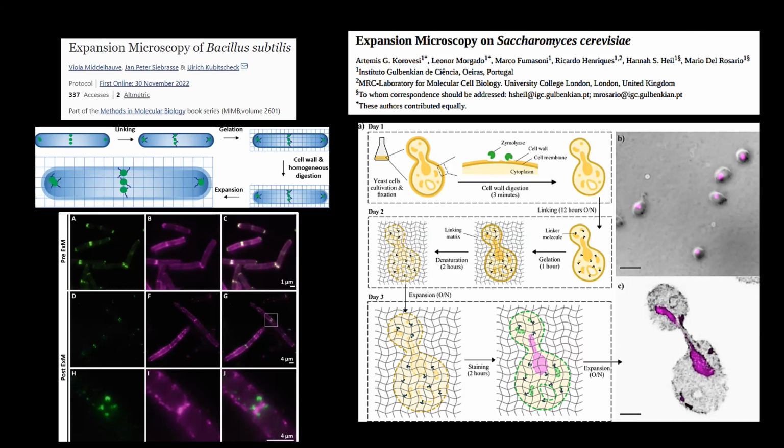And I think the protocols are published for most types of tissues. You just need to look online and you'll find everything. So it looks like it works really nicely for bacteria and for yeast, and the stages are literally the same.